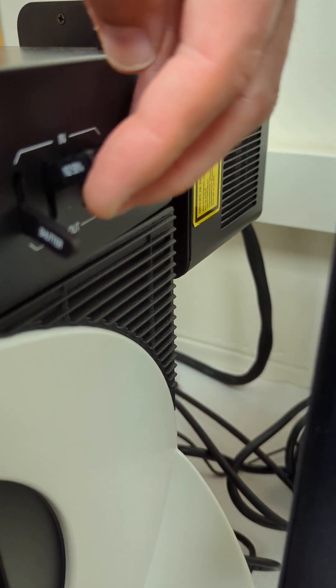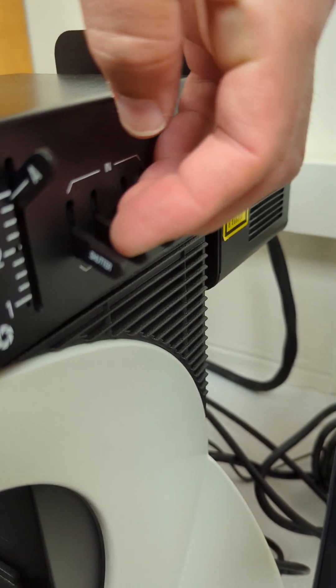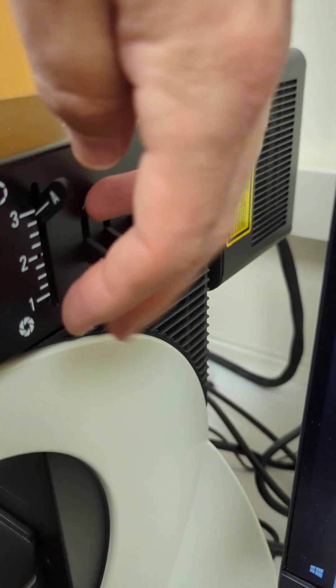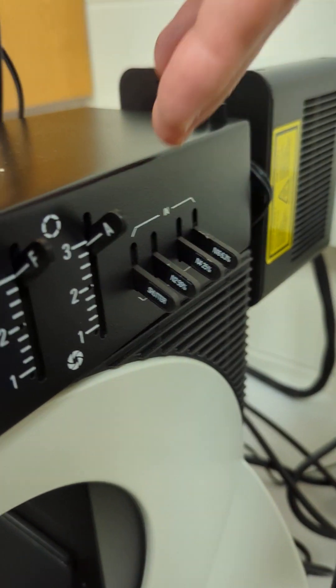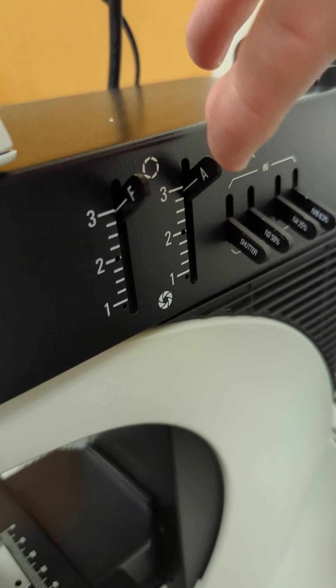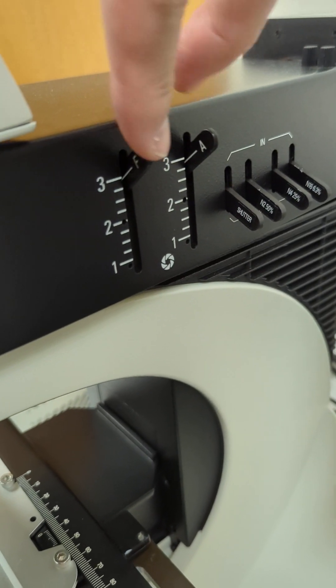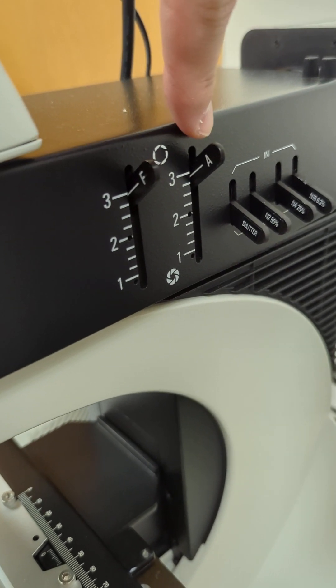You can even flip all of them and you'll get no light. Or you can shutter it completely, and that gets no light.